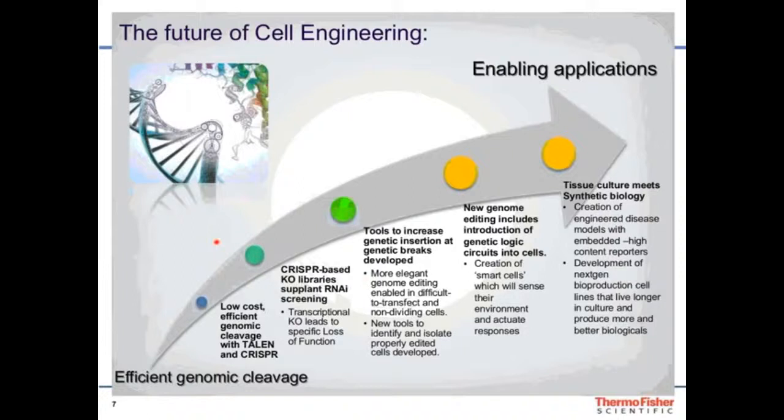I mentioned RNAi and what a breakthrough that was several years ago, but there were some shortcomings. Now using this CRISPR tool, which we'll show you more detail on, we can package that CRISPR tool in other delivery vehicles, perhaps lentivirus, perhaps other things, to be able to do genome-wide or gene set-wide screens to do actual knockout of gene activity.